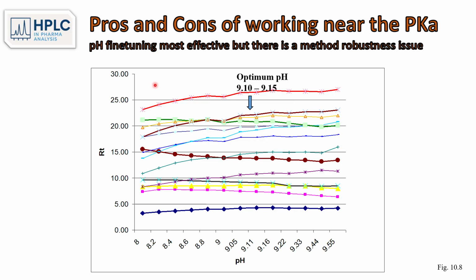Now, since a slight change of pH can actually affect the retention quite substantially, when you operate your pH near the pKa in the sloping part of that curve, the pH fine-tuning is actually very effective, meaning it's a strong factor.